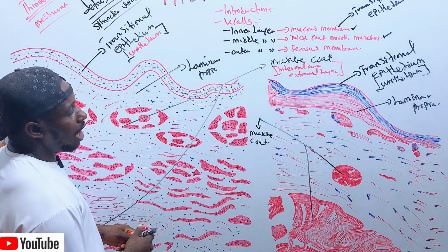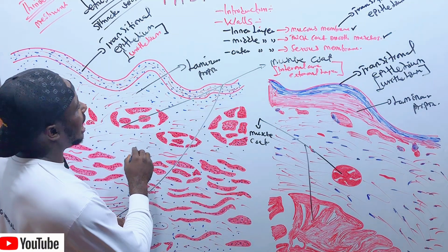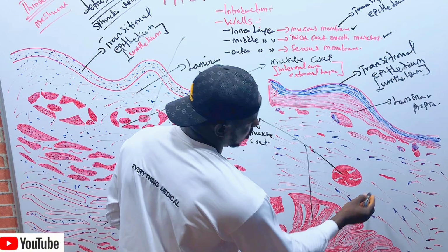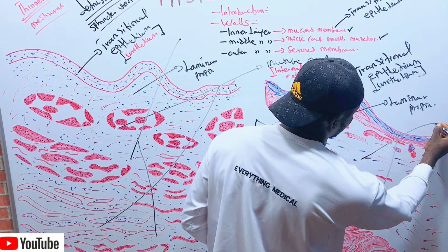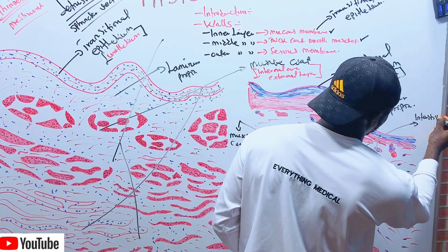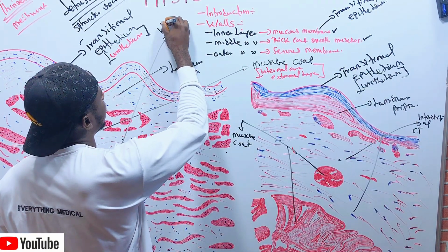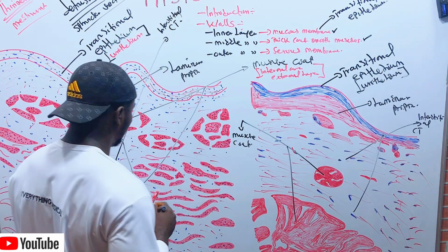Okay? Now, we still have interstitial connective tissue. Yes. There exists interstitial connective tissue here. Look at it here. Interstitial connective tissue, CT.